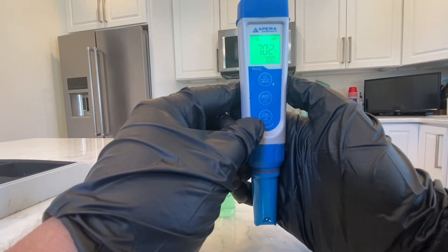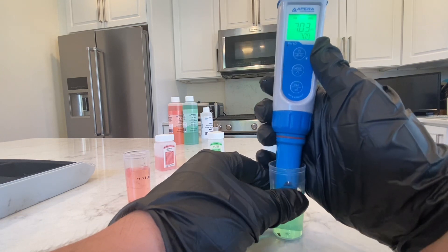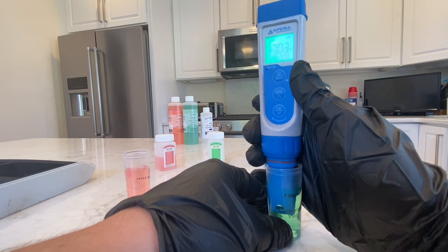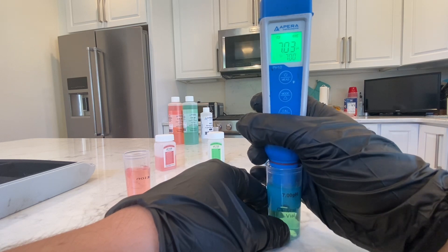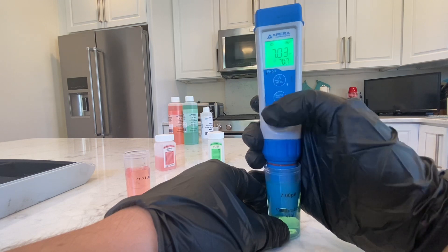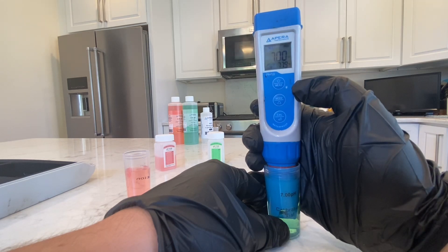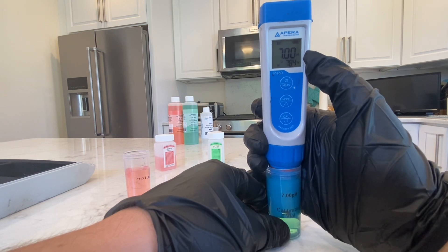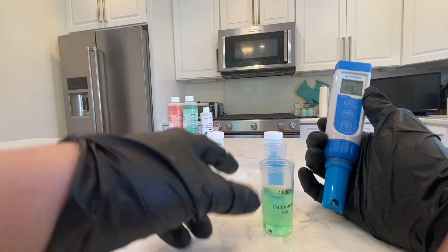So the first thing we're going to do is turn the pH pen on and hold the CAL button — it's the very bottom button. It's going to ask for 7.0, so you can see it's flashing underneath where you'd normally see the pH number. We're going to put the probe in the 7.0 vial. You can move it around a bit, dunk it — just be gentle. When the number stops flashing and you see the little smiley face on the bottom left underneath the calibration number, you want to hold the CAL button again.